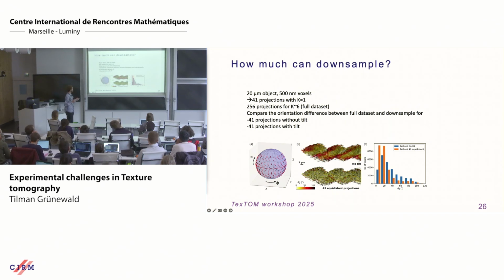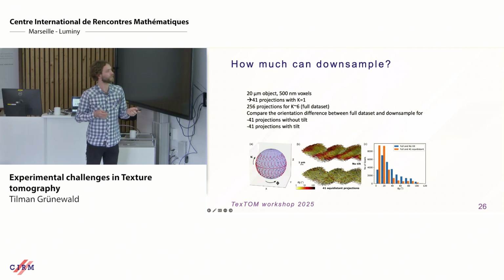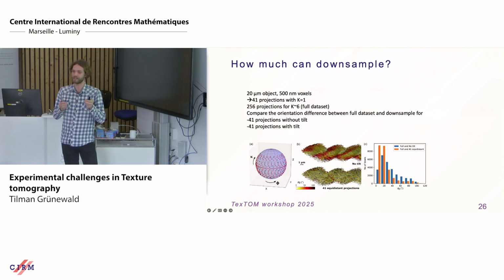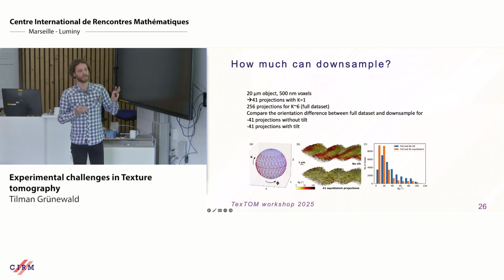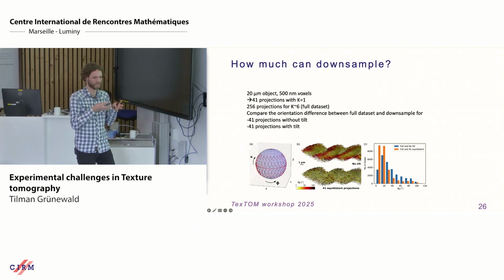but as soon as you restrict yourself to just the rotation without any extra tilts, you start to get these deviations, especially in regions that have a fairly broad texture. Again, this is sample dependent. It's sample structure. It's crystal structure dependent. The diabolic thing here is the codes always give you a reconstruction. You have no way of knowing if you're looking at rubbish or if this is your real sample. So I would try to stay cautious.